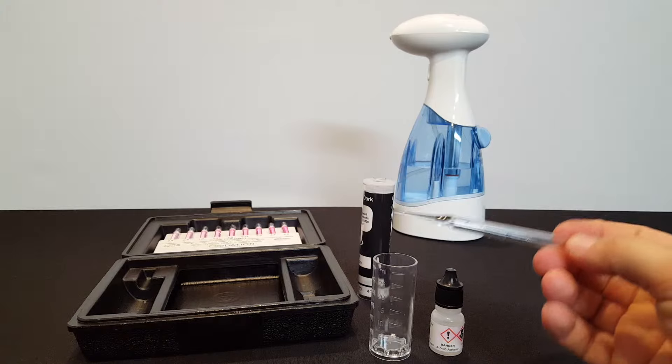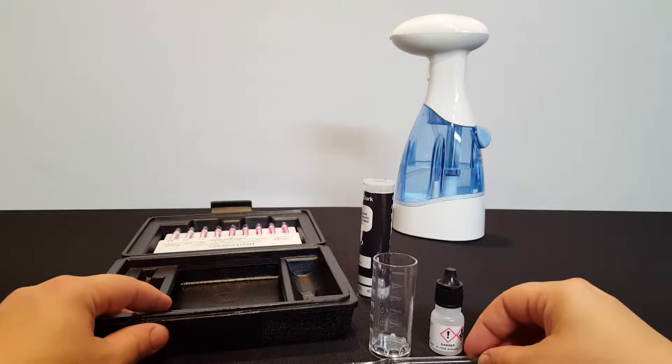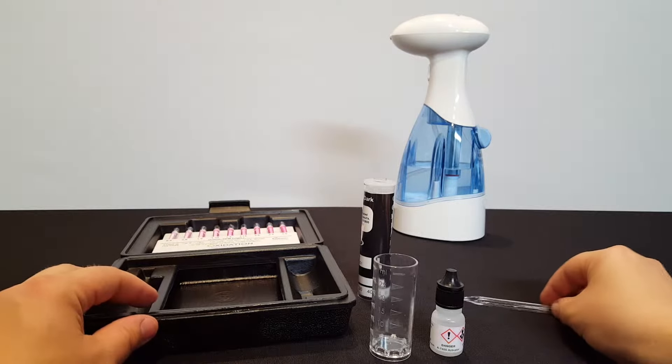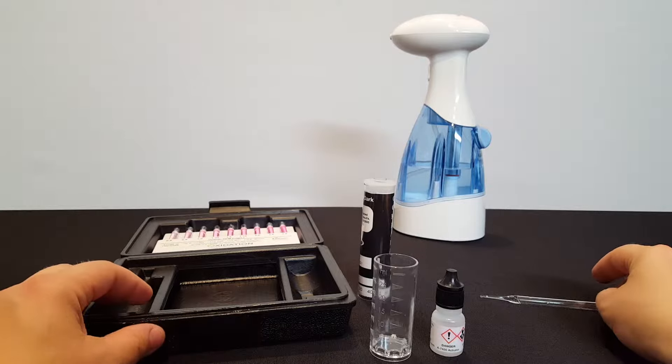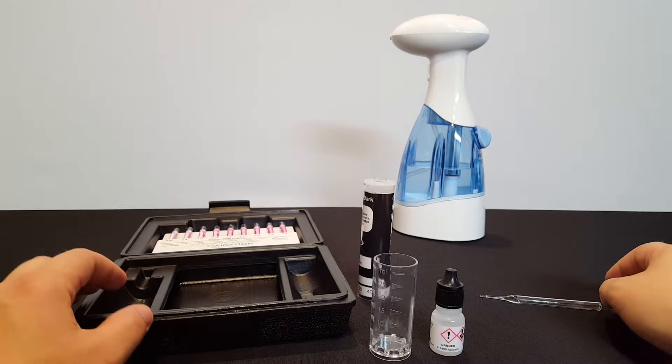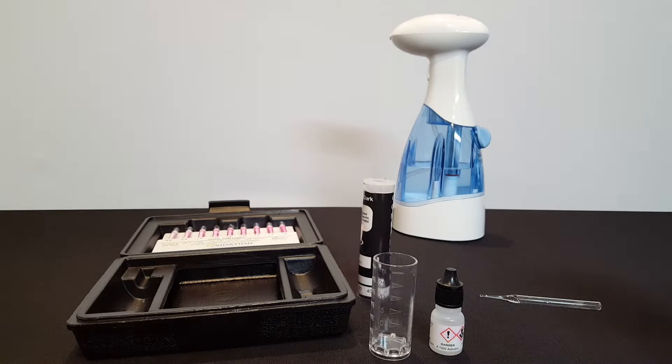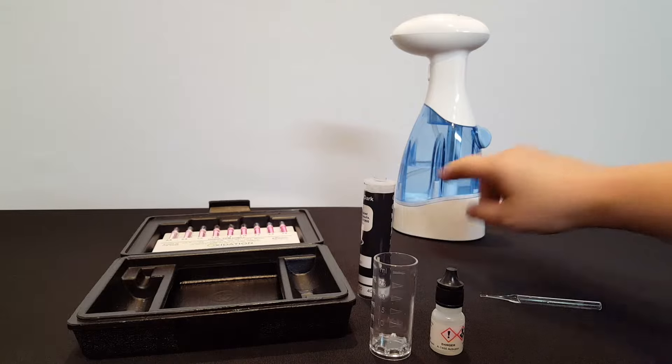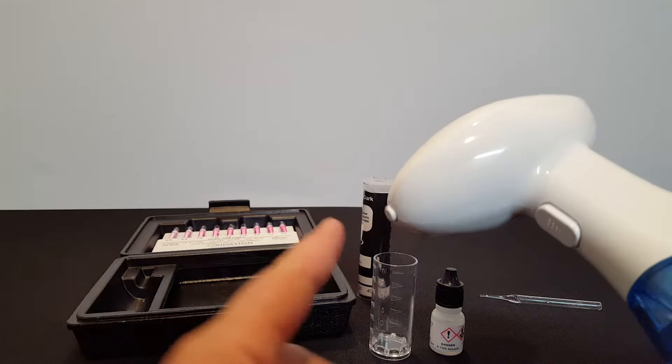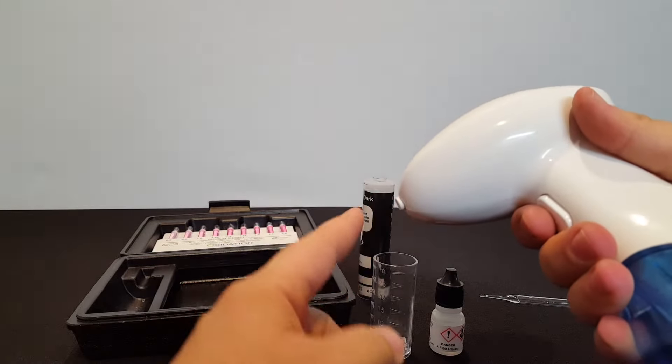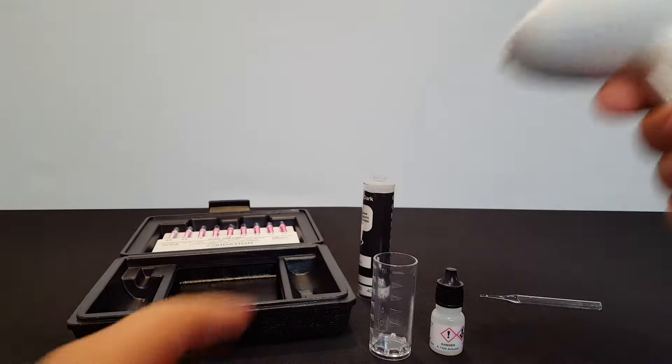To prepare for the test, we'll make sure that we have everything laid out. This is the ampoule for taking the sample with. This is the squirt bottle that we're going to use. Whenever the button is pressed, it produces dissolved ozone that comes out the nozzle.